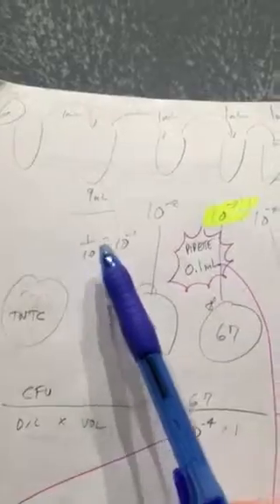All right, next, serial dilutions. So we've got a tube here. We're taking 1 ml, putting it here inside 9 mLs. 1 went in for a total of 10. Therefore, 1 divided by 10 is going to be 10 to the negative 1 power. We're going to do that again. 1 ml, 10 to the negative 2, 10 to the negative 3, and so on and so forth.